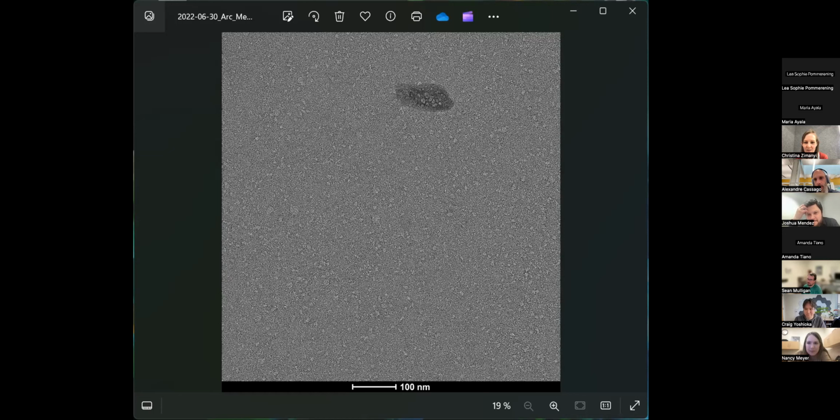Yeah, that's a tough one. I don't have any advice beyond what I mentioned. And that was just that one of the people at PNCC had success in not glow discharging their grids, which I didn't think would work, but it did. So I just wanted to mention.